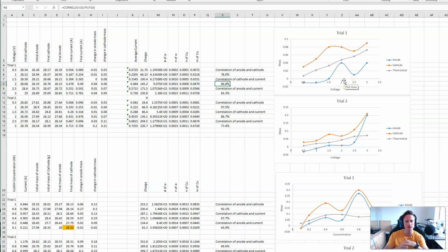And I noticed that throughout the prac, we were taking it from the copper sulfate and going straight to the air dryer when I was saying that we needed to rinse with distilled water to get that copper sulfate electrolyte off and then dry it. So I wonder if that has something to do with the fact that this is always consistently higher and this is always consistently lower, okay?